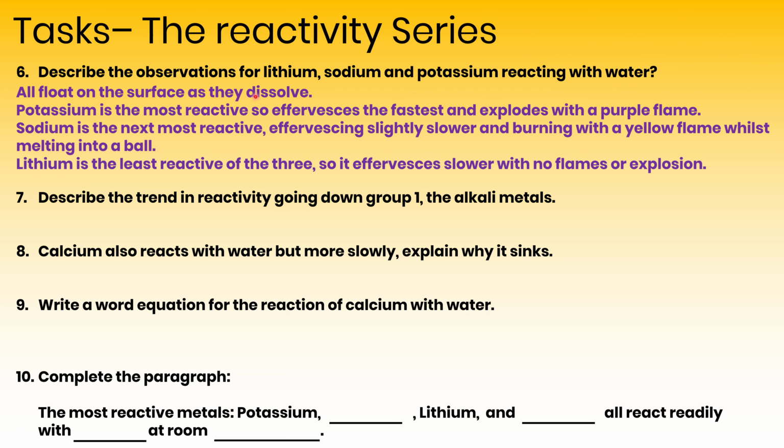All of them float on the surface as they dissolve. Potassium was the most reactive, and it effervesced the fastest, and it exploded with a purple flame. Sodium is the next most reactive, effervescing a little bit slower than potassium, and it burned with a yellow flame whilst melting into a ball. Lithium is the least reactive of the three, so it effervesces slower with no flames or an explosion.